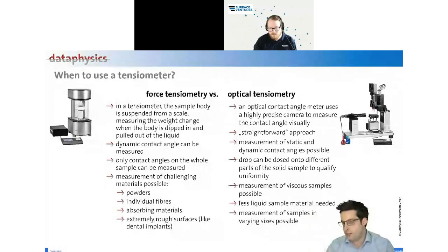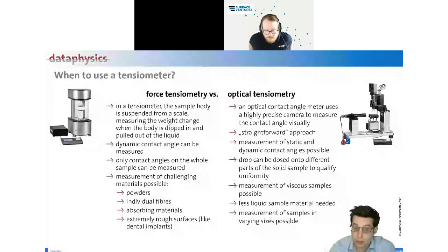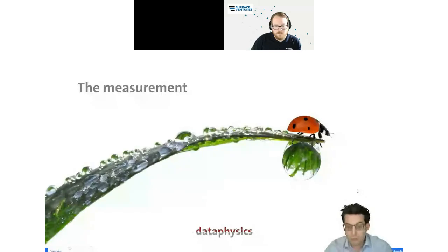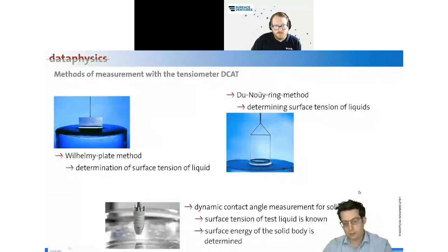It cannot be that we just place a drop of water on it, it spreads completely, and then we say, oh, well, this thing is very, very wettable, contact angle is 0. Like this, we are losing a lot of potential to optimize this kind of material further. And this is the concept that I want to show you in a moment, the concept of the imaginary contact angles. But before, I have to give you a little bit more background information.